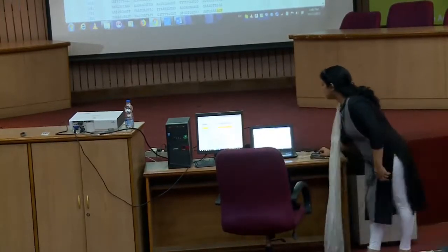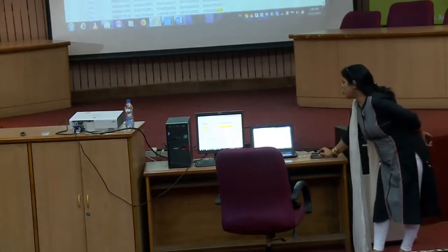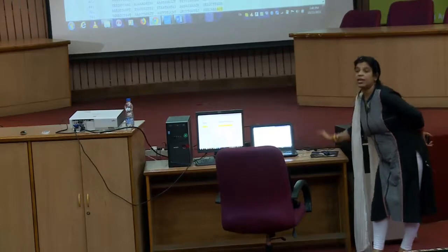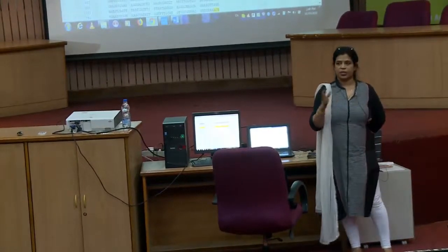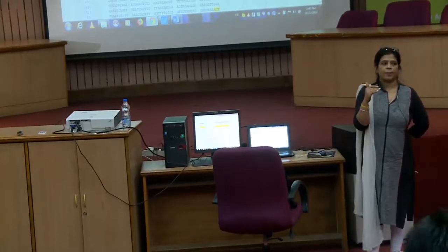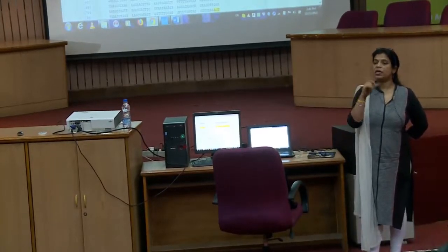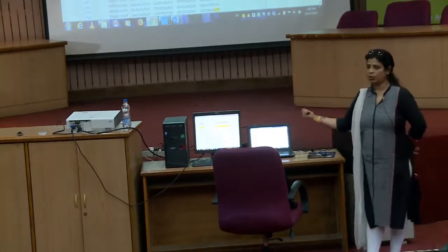So it will give you these two primer sequences. This is the forward one and this is the reverse one. Another thing, a mistake people generally make in the beginning: the forward primer sequence is actually the sequence of the gene which you are putting in over here.